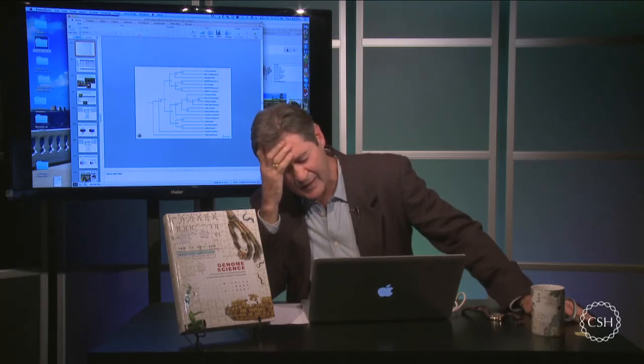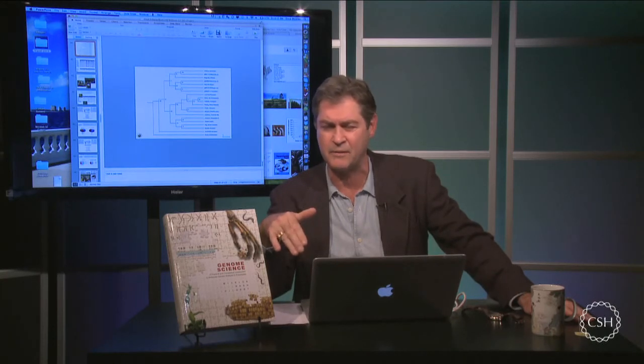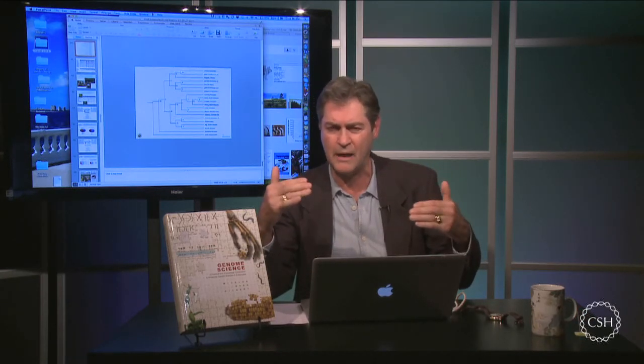Well, let's just assume that your primers are focusing on the same region, because in fact, many times we use degenerate primers. We use a mixture. So long as those primers are amplifying the same region, you'll generate a barcode and you can analyze it nicely.